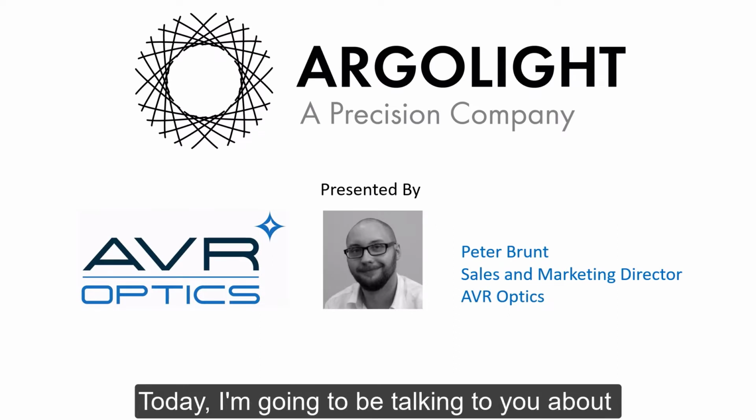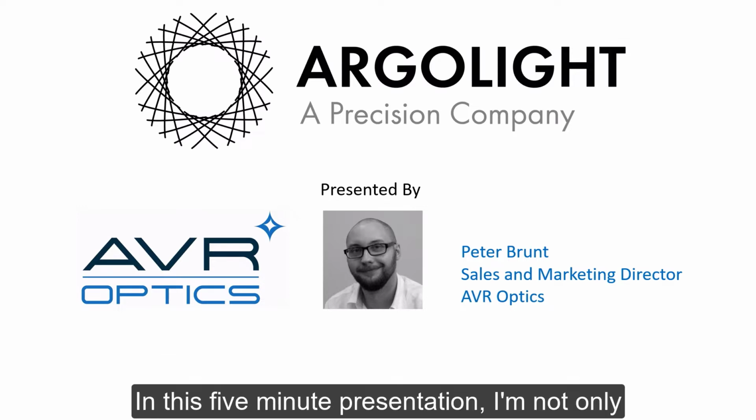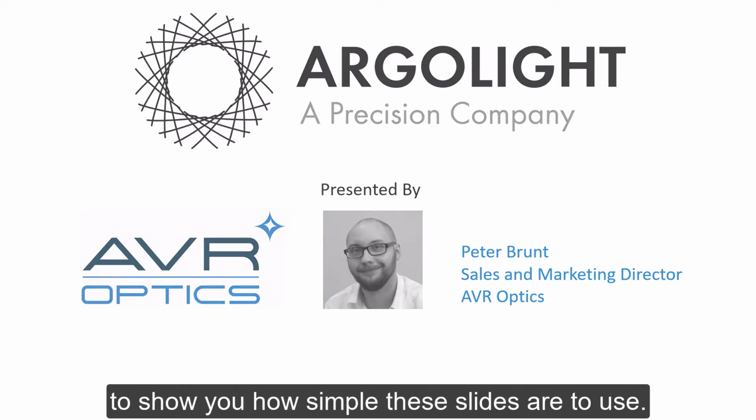Today I'm going to be talking to you about Argolight's game-changing microscope calibration slides. In this 5-minute presentation, I'm not only going to be telling you about how these slides work, but I'm going to be taking you through the workflow to show you how simple these slides are to use.